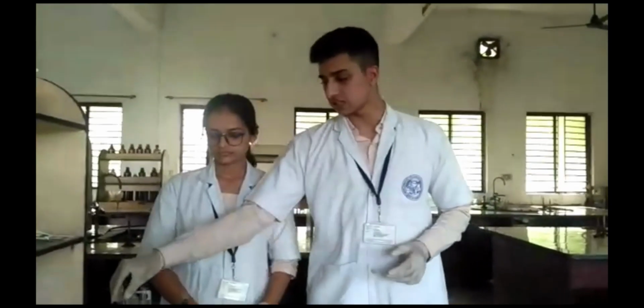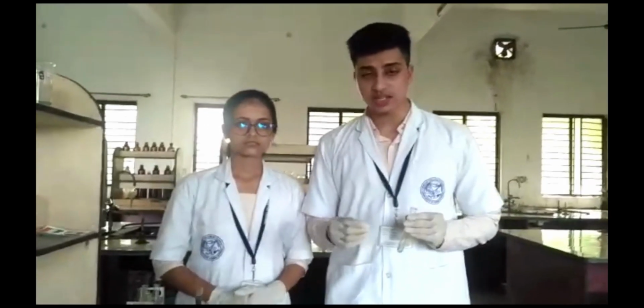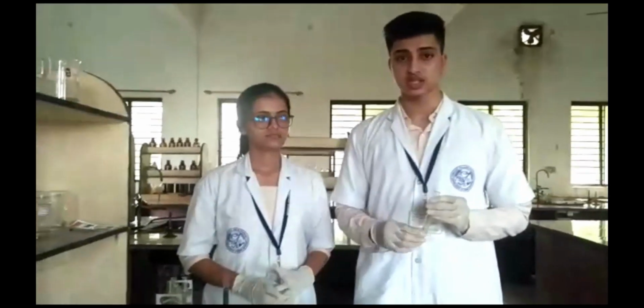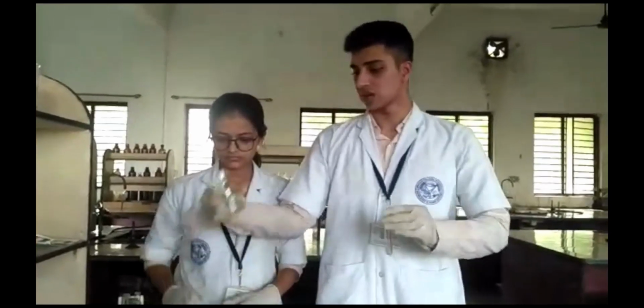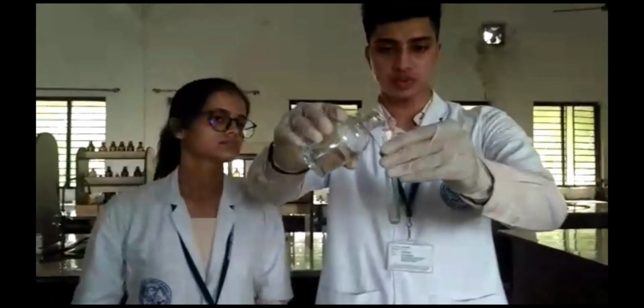So first we are taking the test tube and adding glycerine at the bottom of the test tube. The reason why we are adding glycerine at the bottom of the test tube is because glycerine is heavier compared to the other two liquids. So I am adding glycerine at the bottom of the test tube.